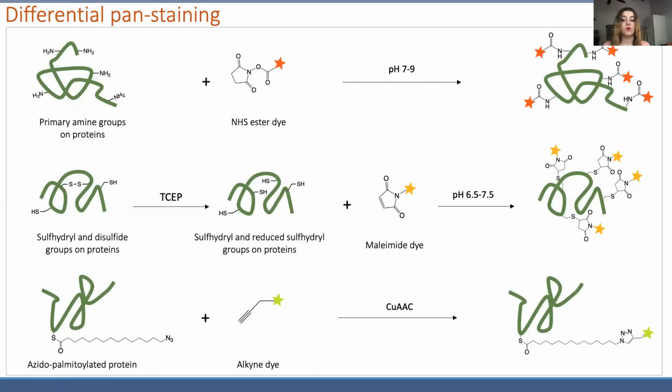However, this goal would require that different subproteomes are in fact compartmentalized differentially, something the literature does not adequately explore due to limitations in staining densely crowded proteins, but something we believe makes rational sense, given that more and more studies today are showing that biomolecules on the nanoscale are inherently compartmentalized or organized and clustered depending on their chemical characteristics. Examples of this include clusters of EGFR receptors on the plasma membrane, lipid rafts on the Golgi, etc. In other words, we hypothesize that the distribution of subproteomes on the nanoscale must be organized.